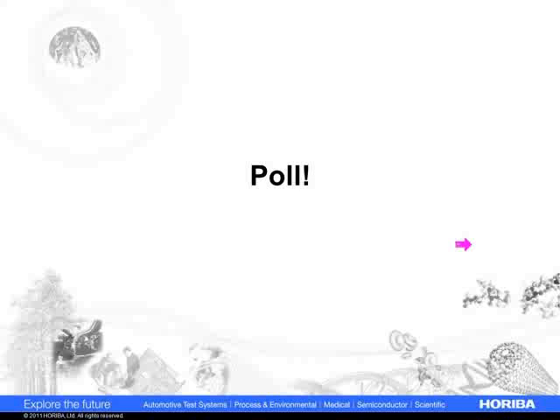Someone who's monitoring D90, D95, and D99.9. Good, good. So I spend a few slides and a few minutes talking about why that can be very difficult to monitor. All right. Thanks very much. We'll move on.